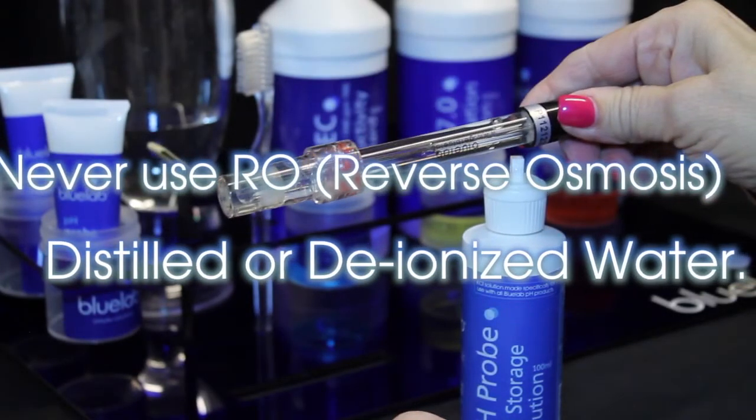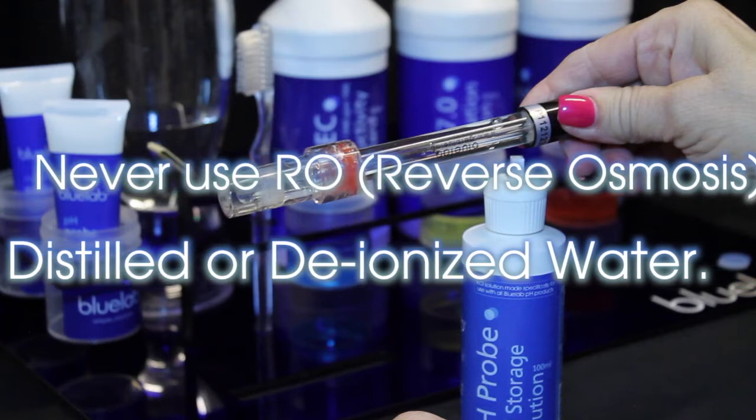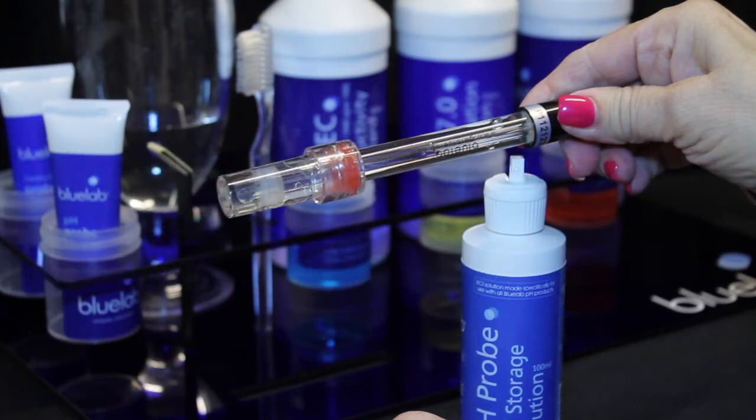Always store the pH probe in KCL storage solution. Never use RO water, distilled, or deionized water. Pure water changes the chemistry in the probe, causing the probe to die.